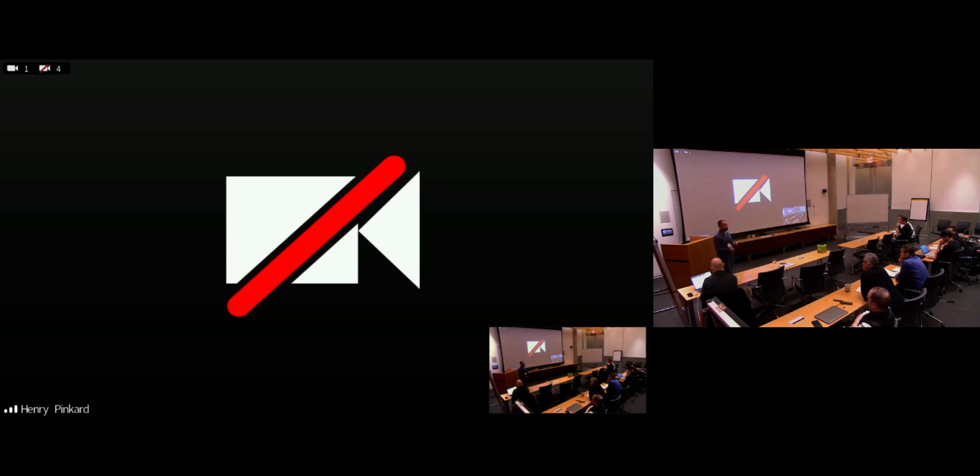So in the end, the situation we are in is we have these experienced Labview developers that help us get to the final goal we need to get. But as a life scientist or as a scientist working with these scopes, you either have to get to their level of expertise to actually contribute to the control software, or you're really relying on them, right? And as a closed system, again, it's a very powerful system, but as closed systems go, it's very hard to deploy to another lab, and transfer of knowledge becomes really challenging. It's not without challenges, and we've seen that in a few instances already. And that brings back to the workshop.